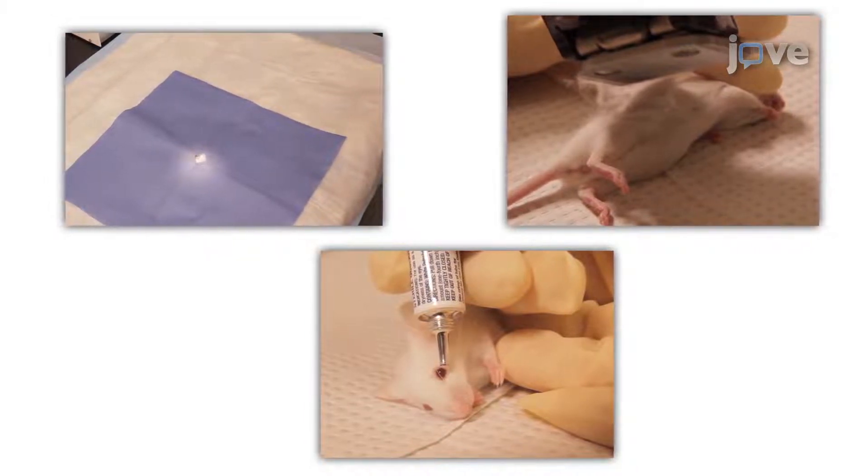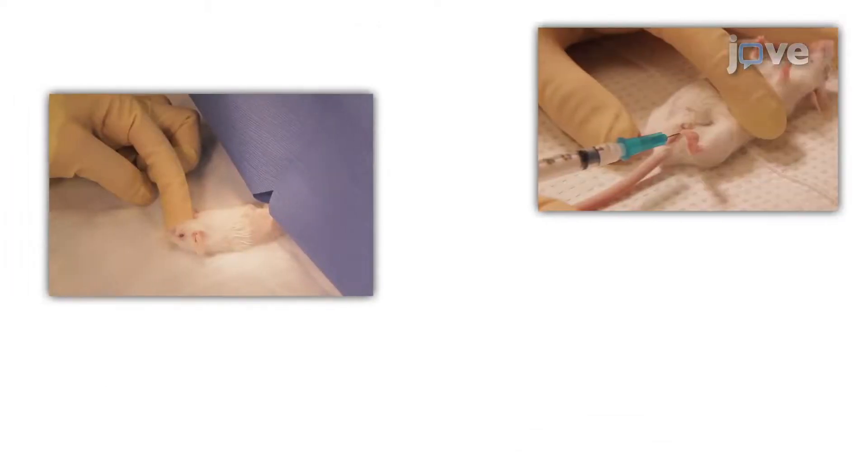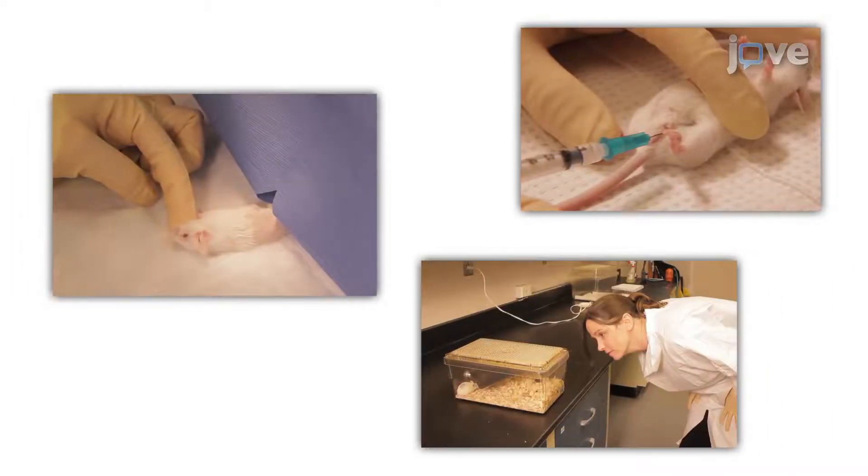Finally, simple surgical considerations such as tissue handling and post-operative care of the surgical subject are discussed.